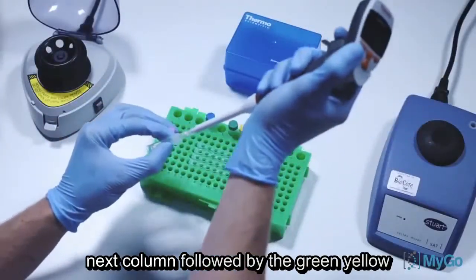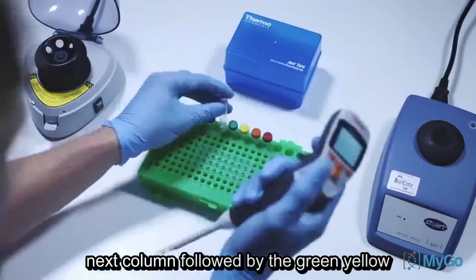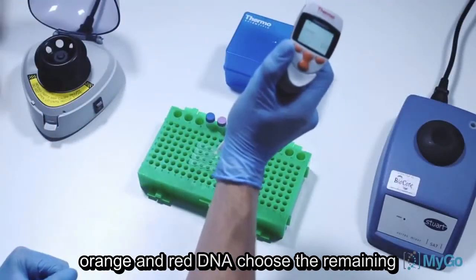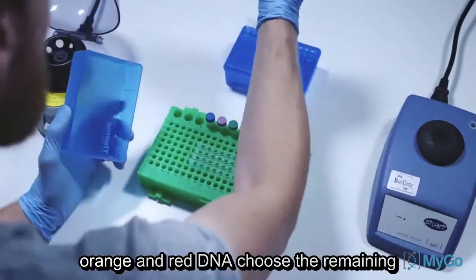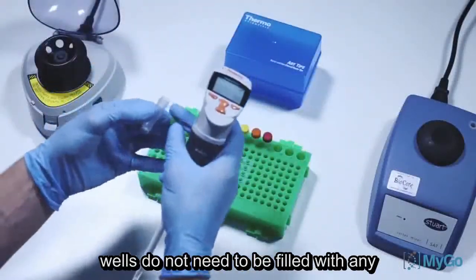Repeat with the purple tube into the next column, followed by the green, yellow, orange and red DNA tubes. The remaining wells do not need to be filled with any reagents.